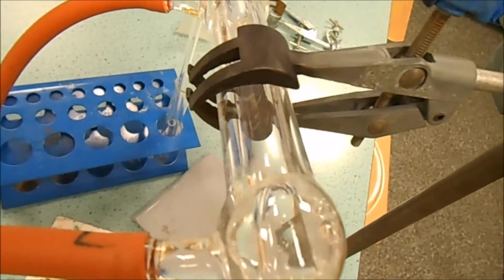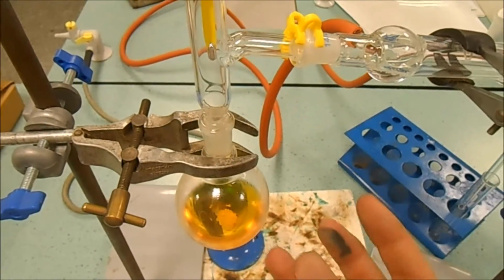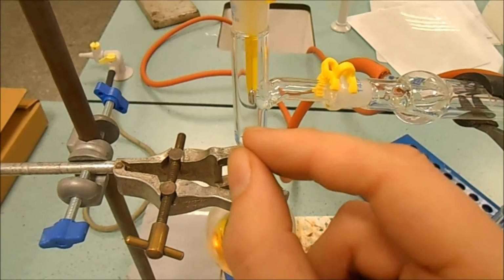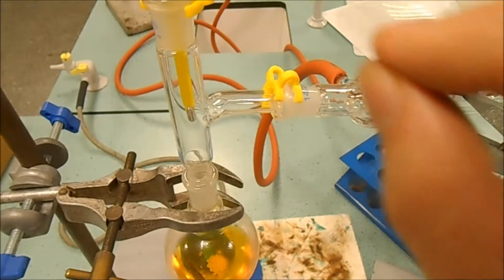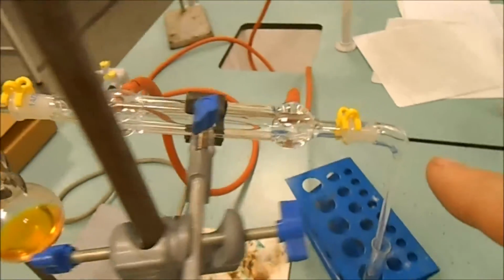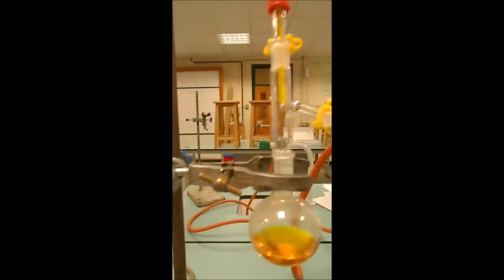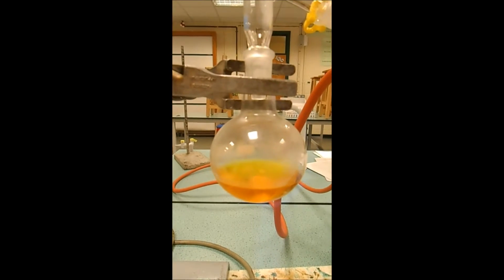Okay, so the product will form in here, it will evaporate, everything's going to evaporate, but as long as the temperature here is not too far above 48.8 degrees, what will happen is most of what comes down this tube and condenses in there will be our product, and that will go into there. What's needed here is skill and dexterity, so I'm just going to take my Bunsen burner and heat it underneath.